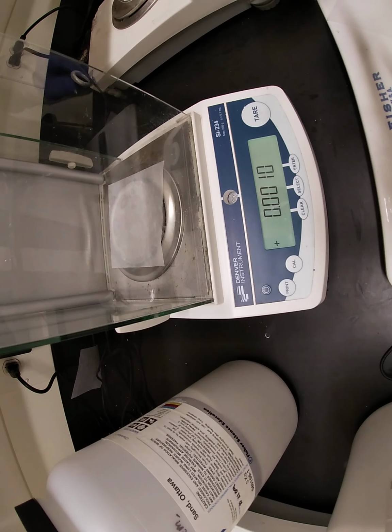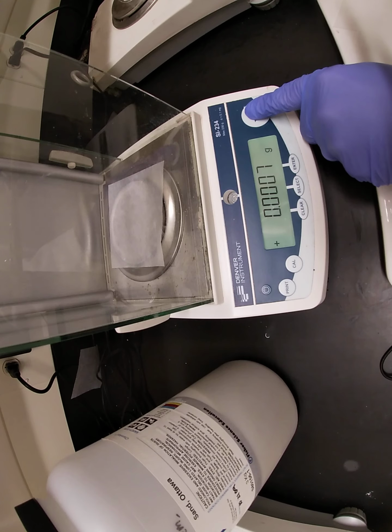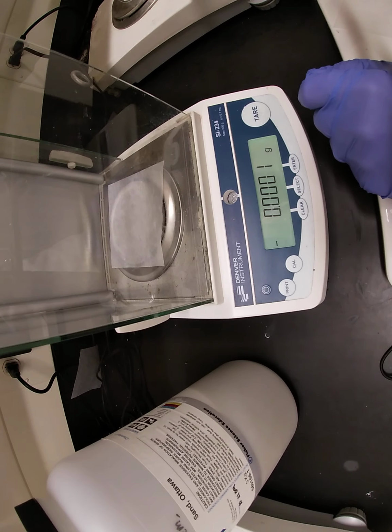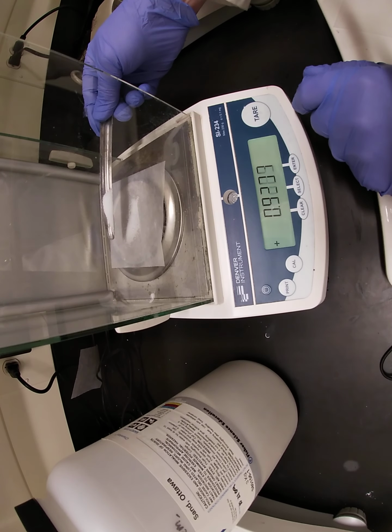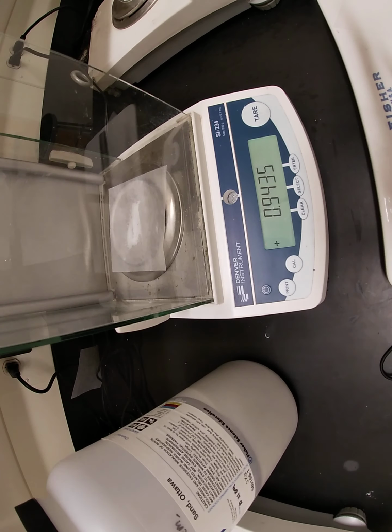So a new piece of weigh paper. And we're going to zero that one more time. There we go. And we're going to try to add somewhere around the same amount.